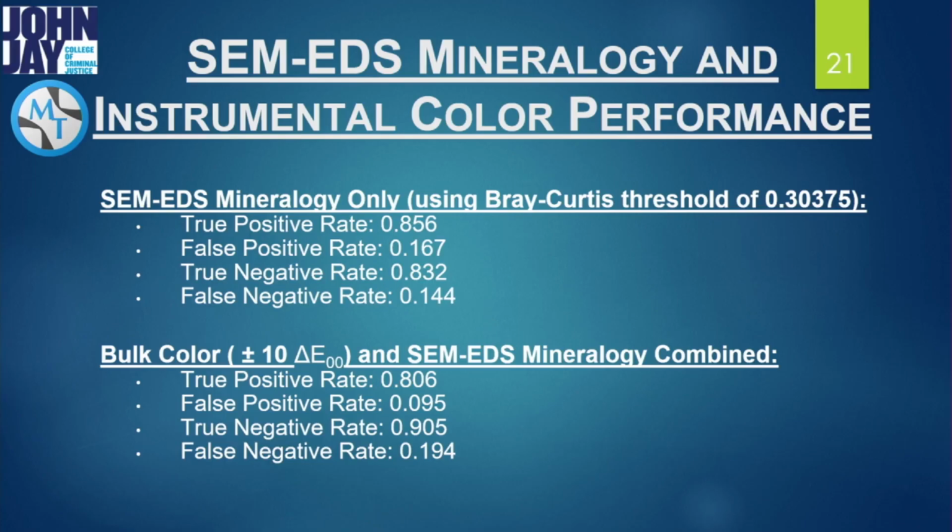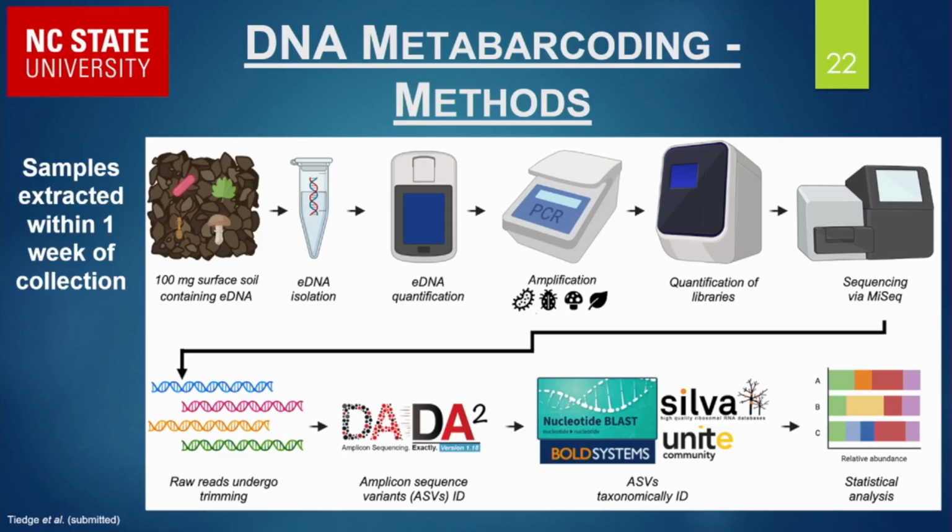Okay, so Jack has talked about two of our new quantitative methods. I'm going to touch on the third quantitative method, which is the analysis of the organic components using DNA metabarcoding. I'm just going to quickly walk through what the DNA metabarcoding workflow consists of.